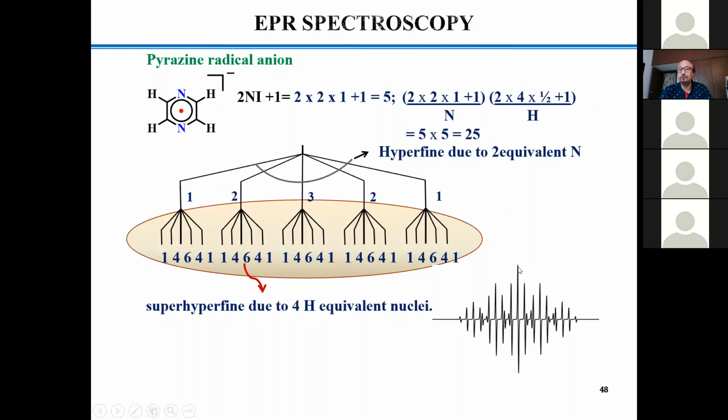After that it decreases again to 12 and then to 6. I'm talking about the maximum one, and that is why it happens like this. And that's why EPR looks very symmetric. If ideally it is correct, it looks very symmetric and rather beautiful also.